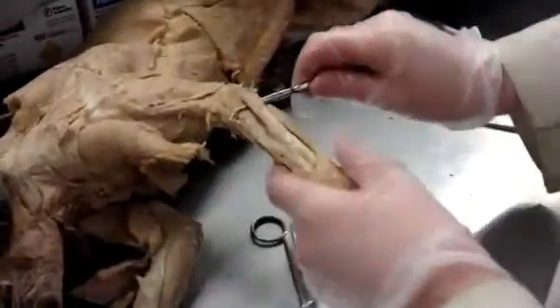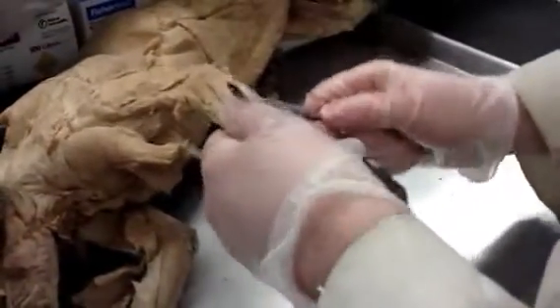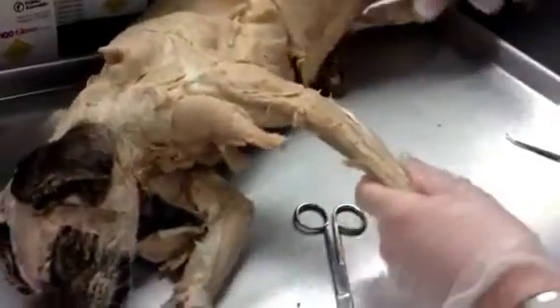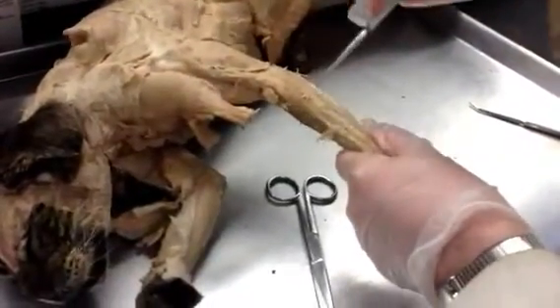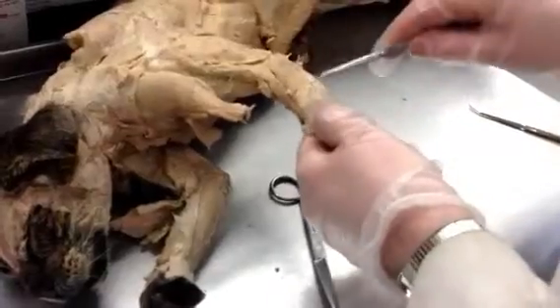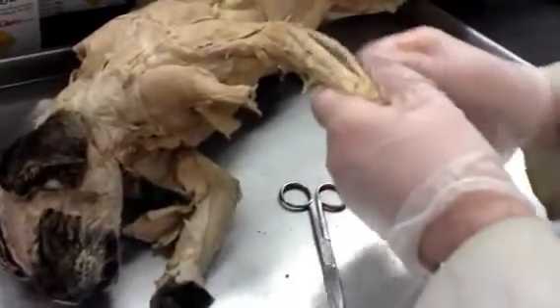You have to just keep repeating it again and again: brachioradialis, one; extensor carpi radialis longus, number two; extensor carpi radialis brevis, number three; extensor digitorum communis, number four; extensor digitorum lateralis, number five; and on the ulnar side is the extensor carpi ulnaris.